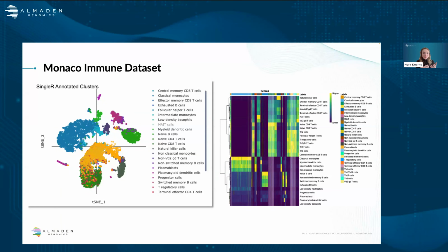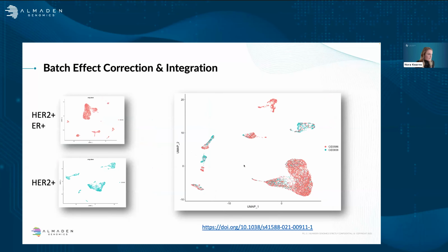But this is an example of the kind of iteration that you can do on Genome, and that's something that we want to support. One specific characteristic that we use to support that is cloning our runs. So we don't want you to ever have to go all the way back to the beginning of your analysis and run it all the way to the end, because cell type annotation is kind of the last step you perform. You can just clone your run and run only this step on 2 or 3 different data sets until you see what you're expecting to see.